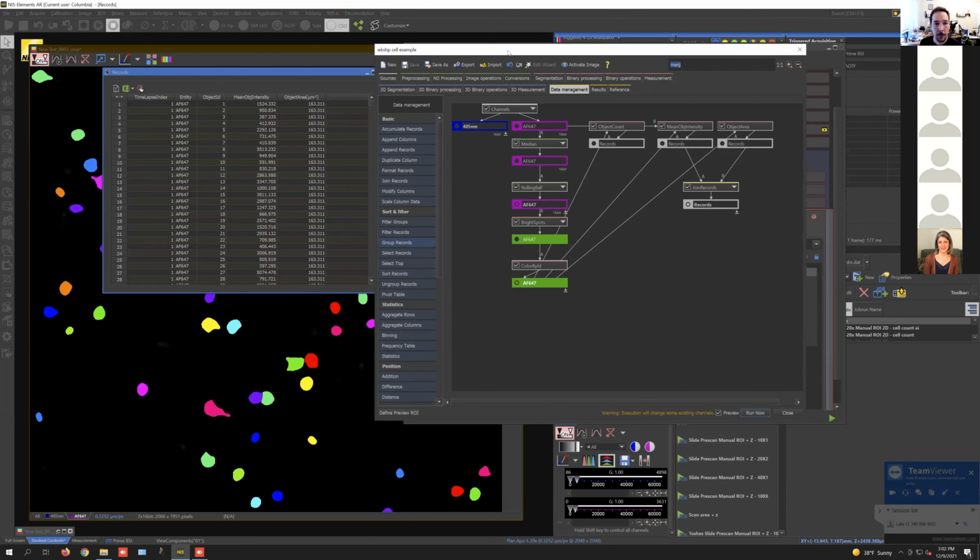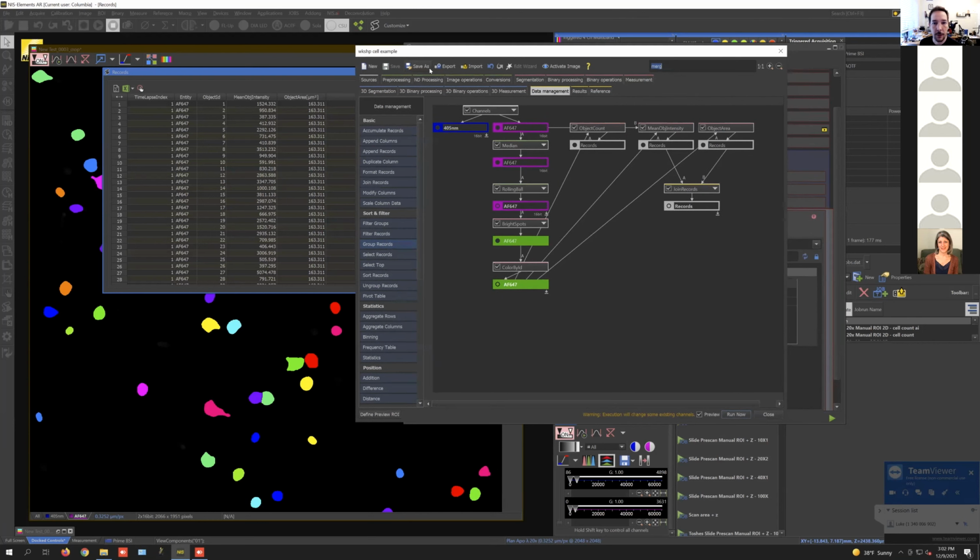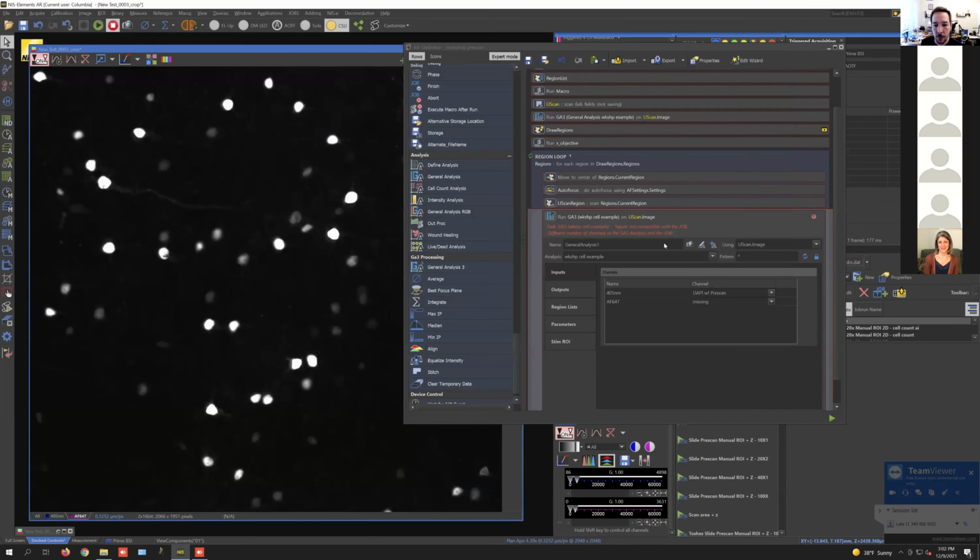So I actually set one up previously, saving the CSV file. I'm going to walk you through it anyway, just so that you can have an idea of what's going on, but it's not something you really have to remember how to do because it's just a little bit more complicated than it needs to be. Let me just show you.